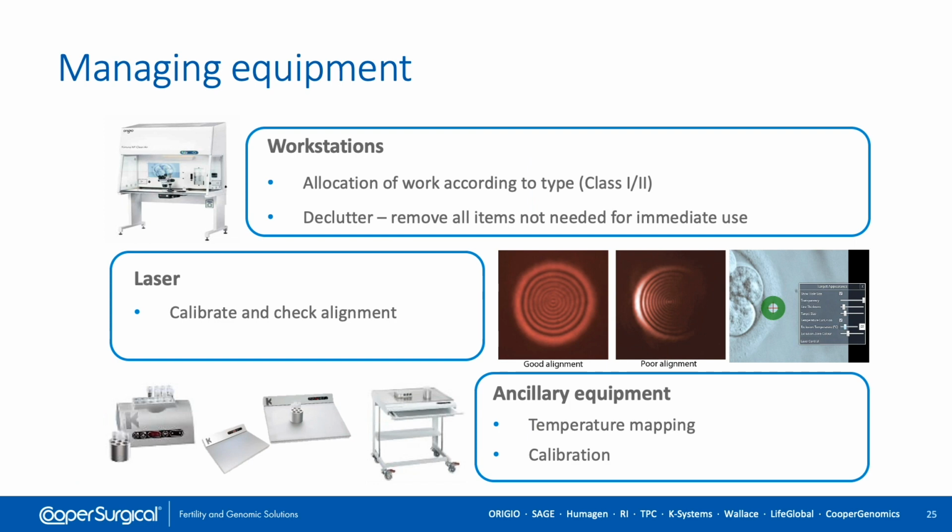Work should be allocated to Class 1 or Class 2 workstations, depending upon its relative risk to staff. Lasers should be checked for calibration and alignment, and ancillary equipment may also require temperature mapping and calibration.